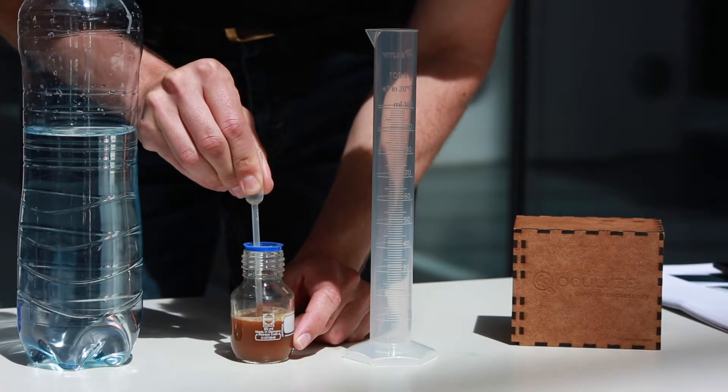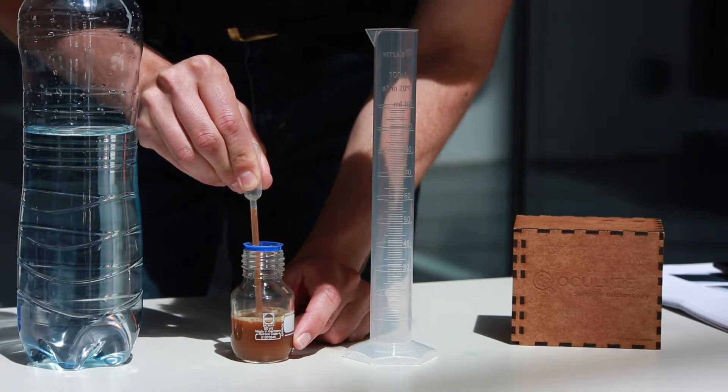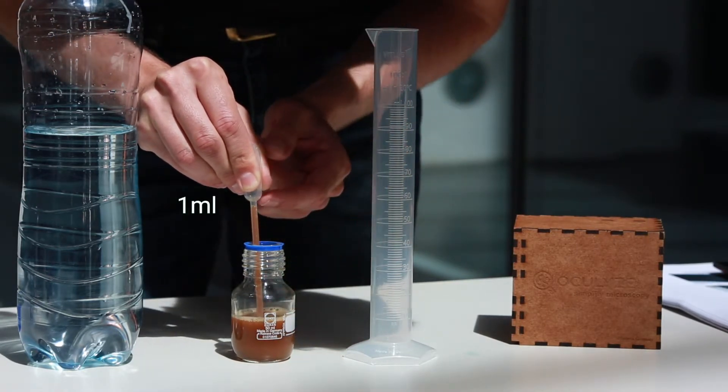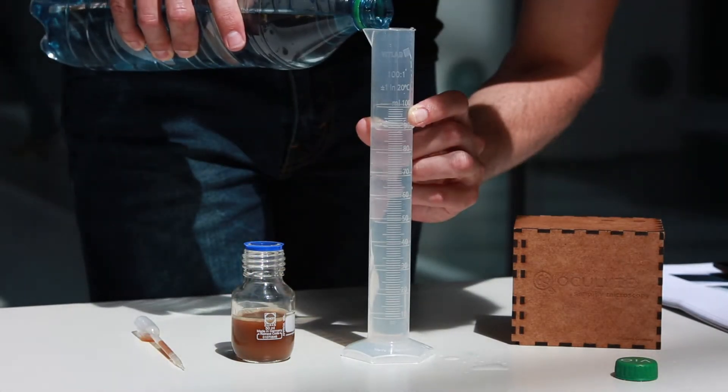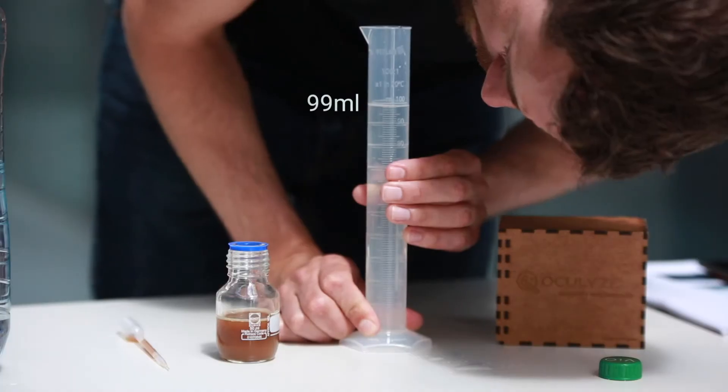Step 1: Fill your Pasteur pipette with 1 ml of yeast. Step 2: Fill your measuring cylinder with 99 ml of water.